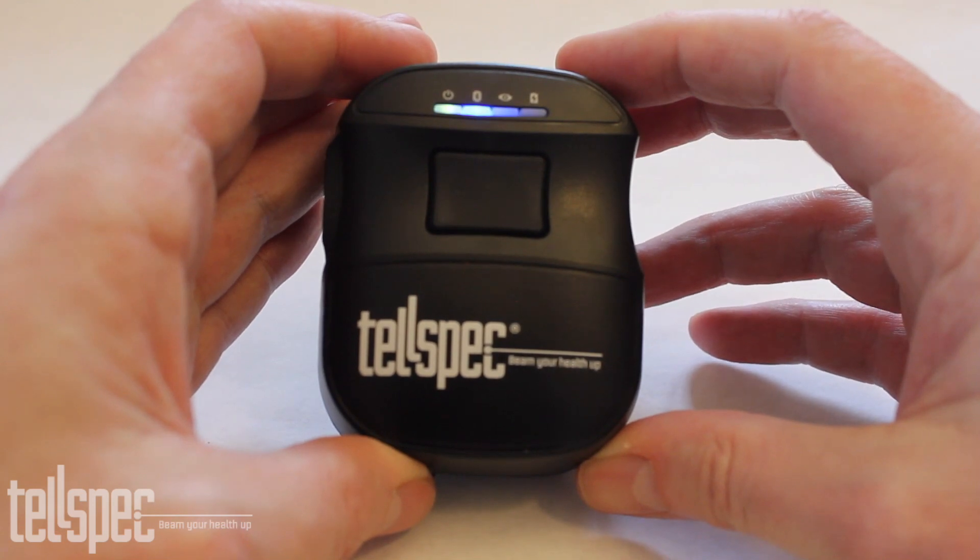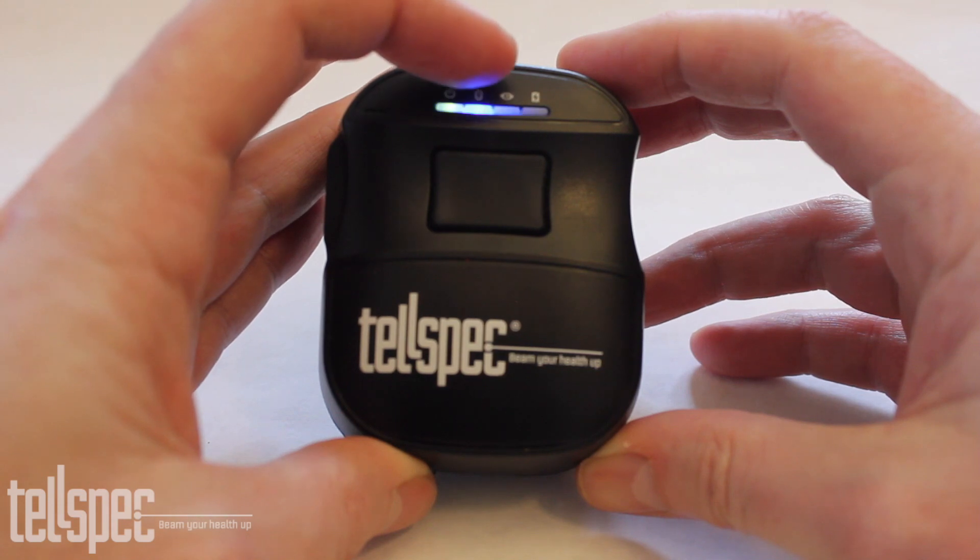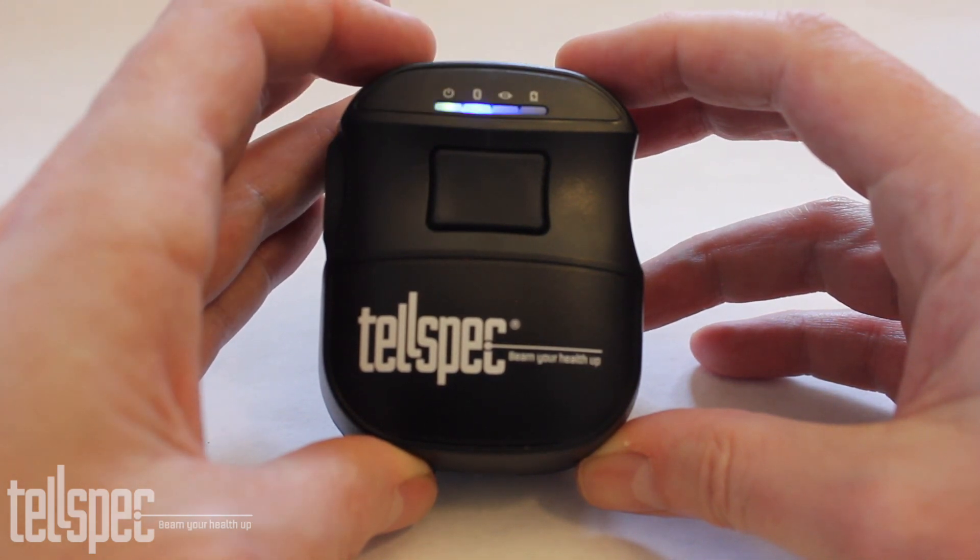There are LEDs on the top. The first one is the power. The second one is the Bluetooth status. The third one is scanning, and the fourth one is for charging.